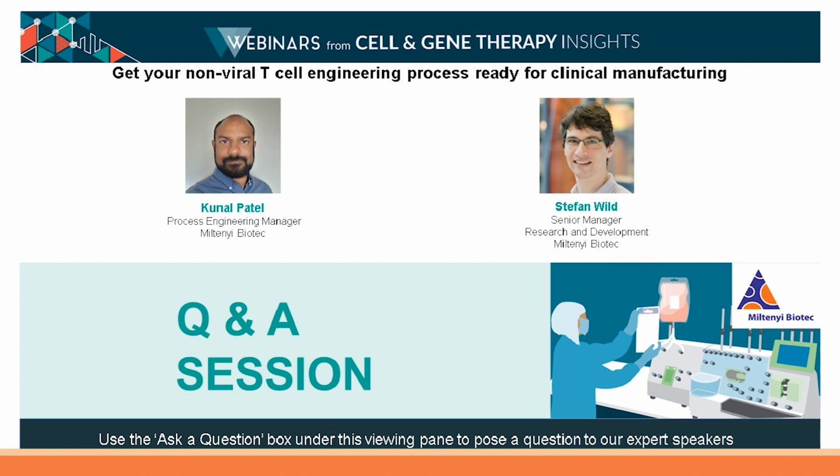Maybe I can take this. Yes. So we are working on a bigger chamber, which would cover nearly 3 times the volume as compared to the current chamber. And this is planned to come next year, basically. And we will also have electroporation processes, which would use the large chambers, of course.